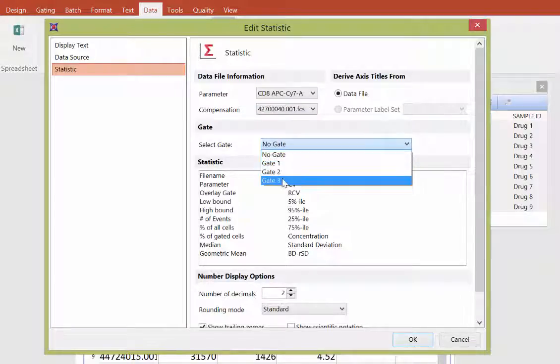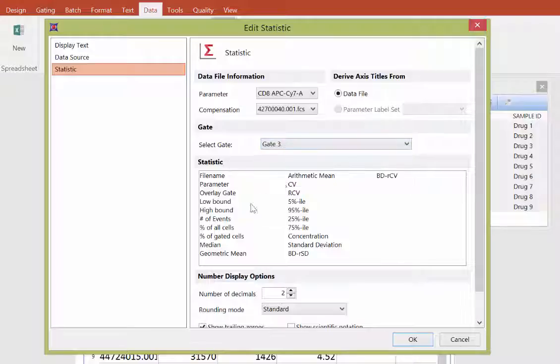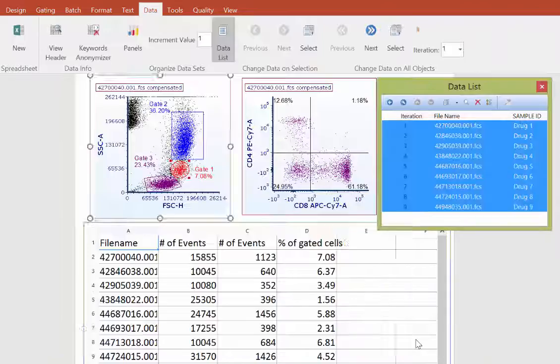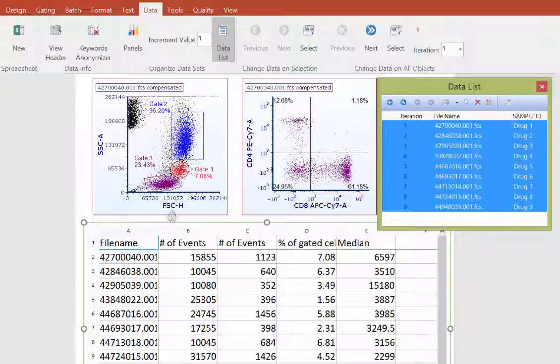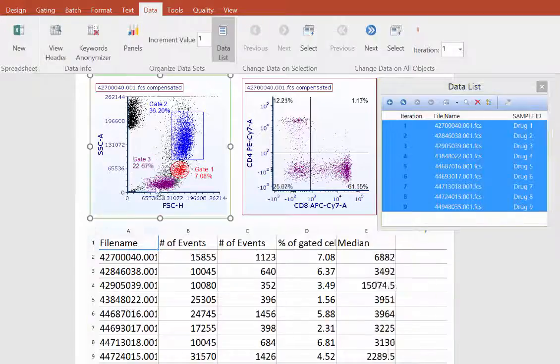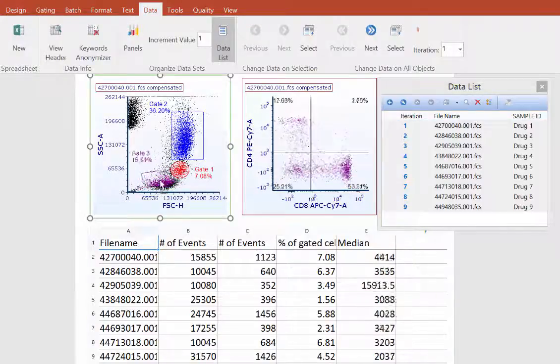We'll choose the median CD8 intensity and click OK. When the statistics are inserted, as you adjust your gates, your statistics will update in real time.